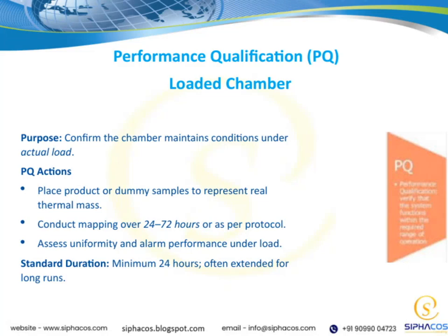Now, let's talk about performance qualification, or PQ, specifically for the loaded chamber. The main purpose here is to confirm that the chamber can maintain the required conditions when it's actually loaded with product or simulated loads. This step is crucial because it ensures that under real working conditions, the chamber performs reliably and consistently.